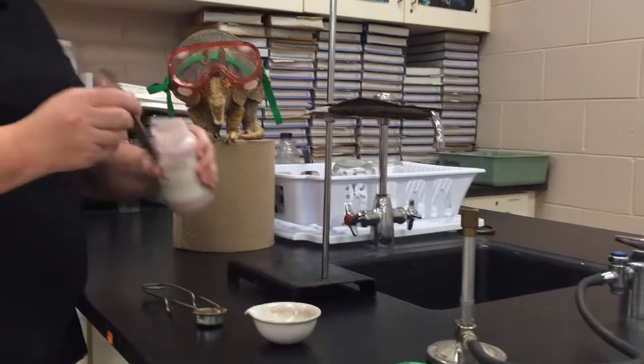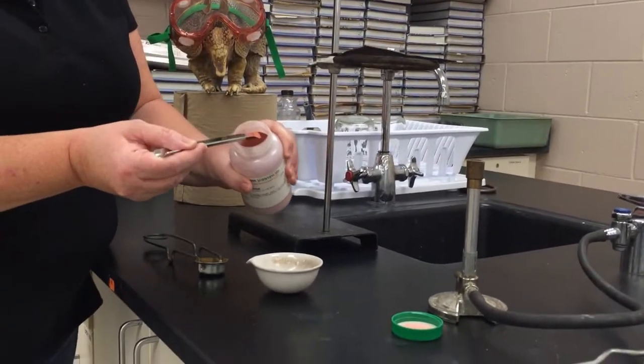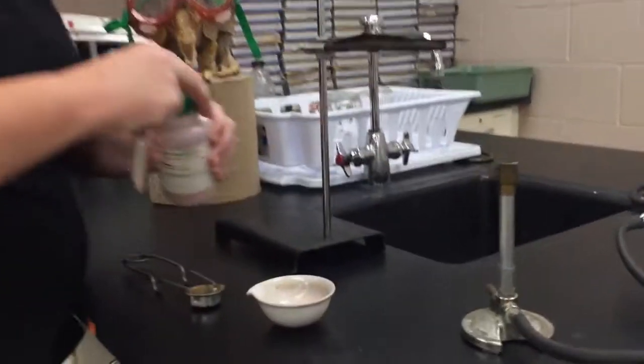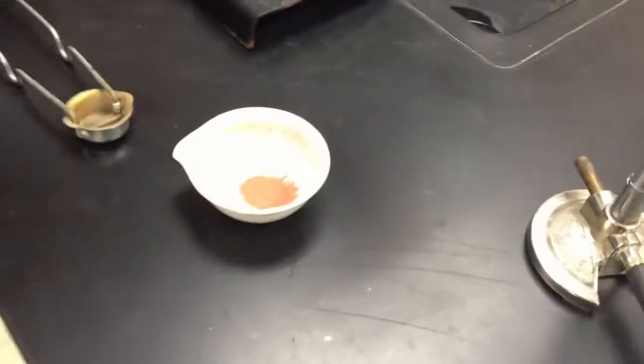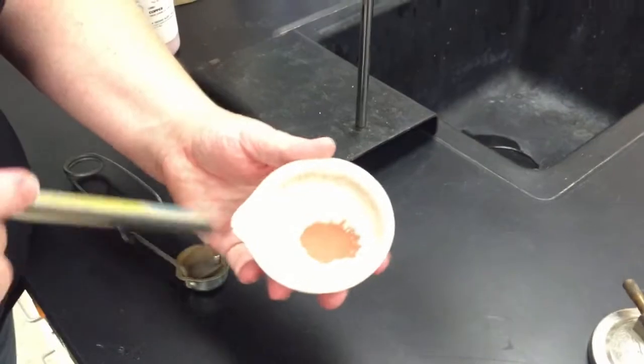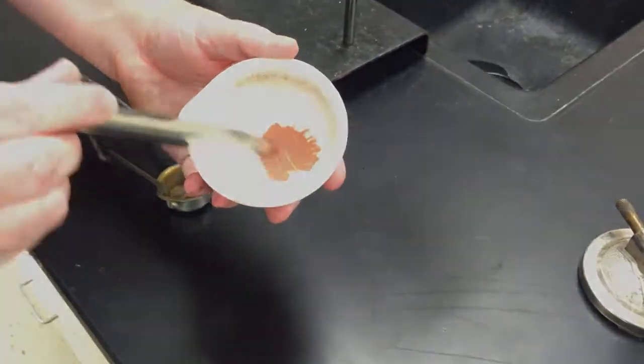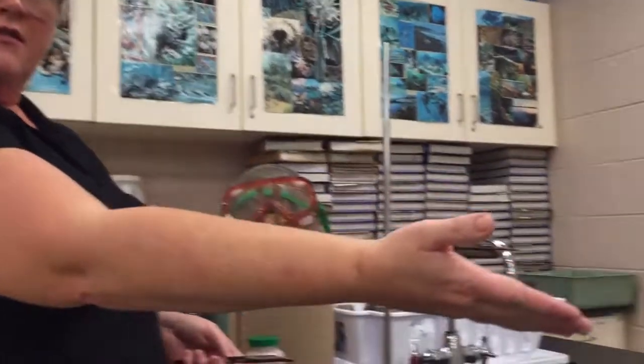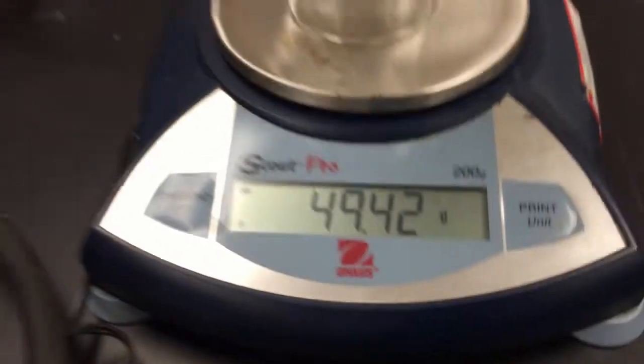And I asked students to think about, if we heat this powder up, if it will gain weight or gain mass, lose mass, or stay the same. So in order to do that, I had to get an initial mass, and it appears that the initial mass here is 49.42 grams.